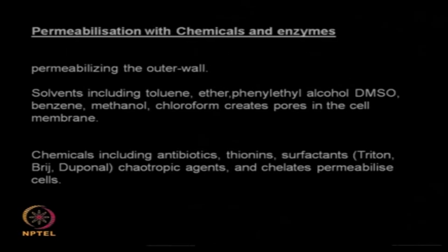This is also a very mild method, and it is a good method because, unlike your mechanical or thermal methods where you are heating and may be worried about deactivation of the biomolecule, here the method is so mild. You are not creating any high temperature or shock or sonication. The only problem is these chemicals should not deactivate or inhibit the protein or biomolecule which you are looking at. That is the only point you need to keep in mind. For example, the ether should not deactivate the enzyme or protein which you are trying to recover.